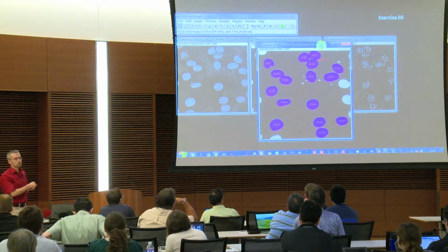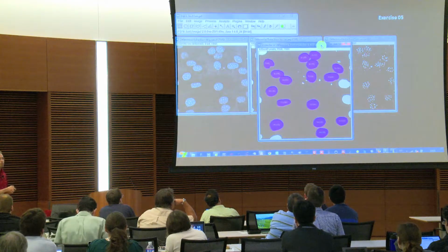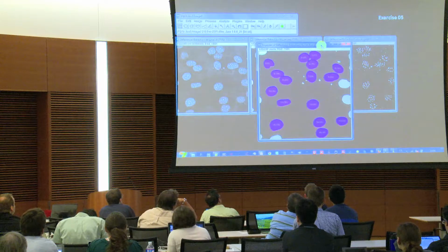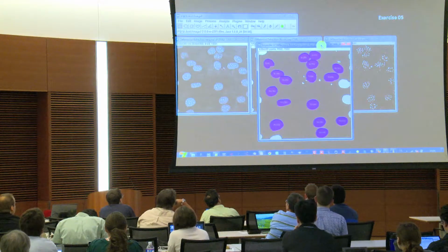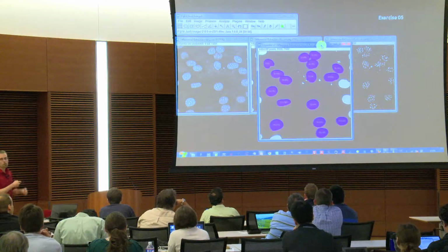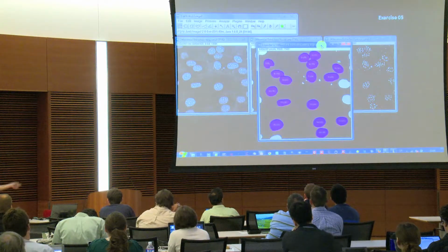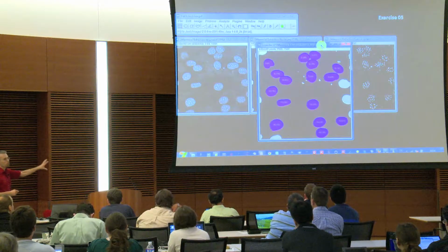So what you get is the color-coded objects. White means excluded, magenta means analyzed, and the first number is the number of the object, so they're just consecutively numbered, object 1, 2, 3, 4, 5, and so on. And the second number in the bracket is the amount of small objects contained inside. So this is the basic principle.